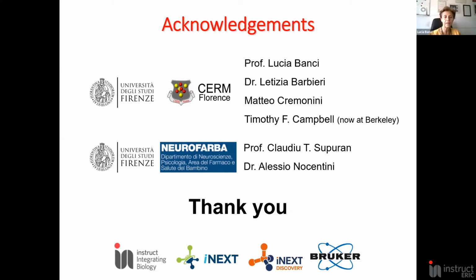Okay. Other question, if you don't isotope enrich the protein of interest, how much excess of protein do you need to get the signal over the background? And also he commented, great talk. No, thanks. Thanks a lot.